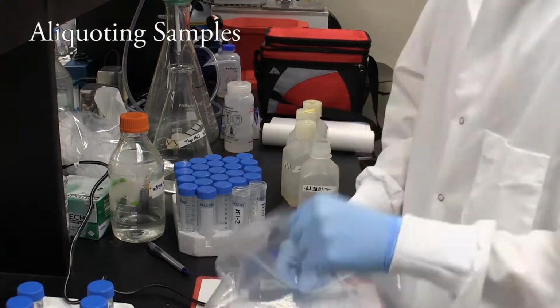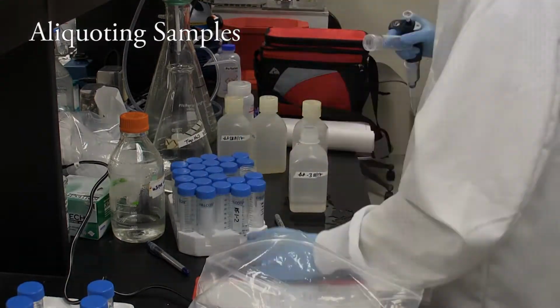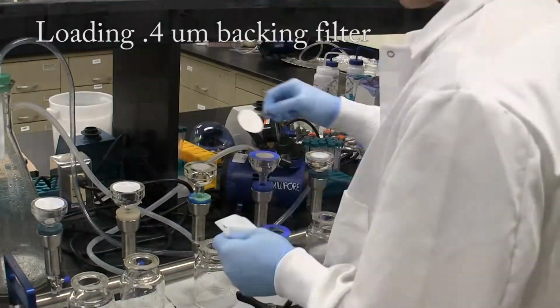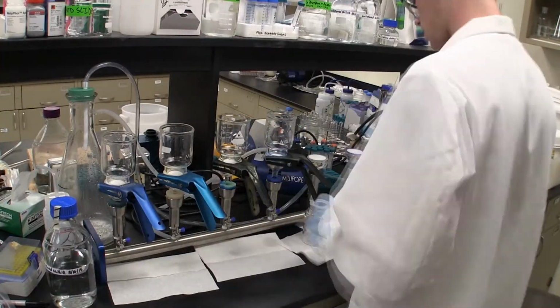To filter, we bring the samples to the lab and filter 15 milliliters of the sample we just took through a 0.2 micrometer filter. This pore size is smaller than nearly all bacteria, so we can be confident that the bacteria present on the filter is essentially all of the bacteria that was present in our water sample.